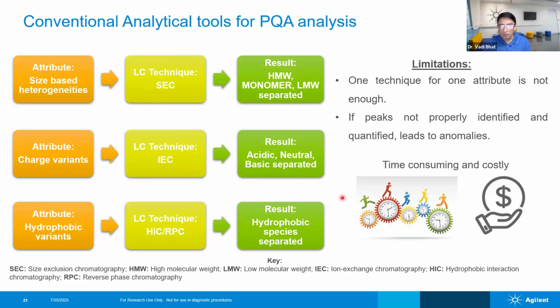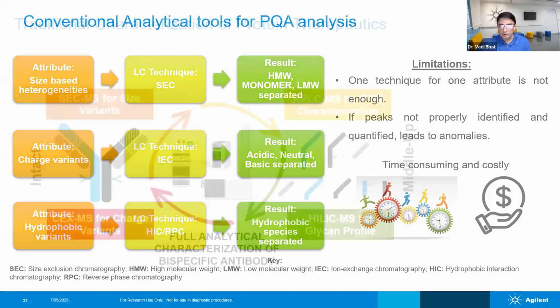Now one wants to get the mass information ultimately for these samples, right? And you want to know what is the mass of these peaks. HPLC gives you the peaks, and the mass spectrometer gives the molecular level information, that is the mass and charge. Essentially, it gives much more information than the HPLC based methods.